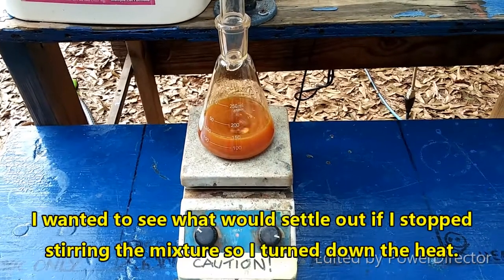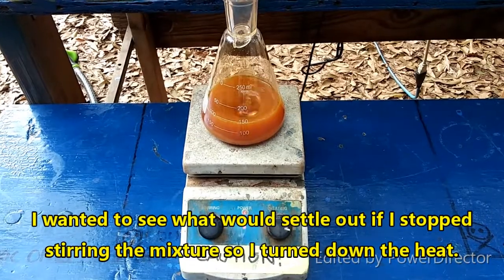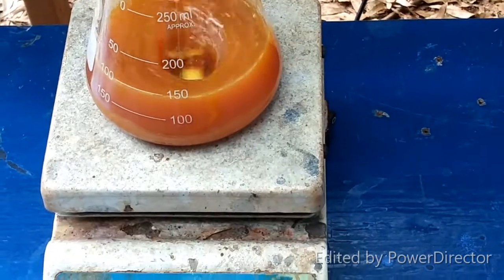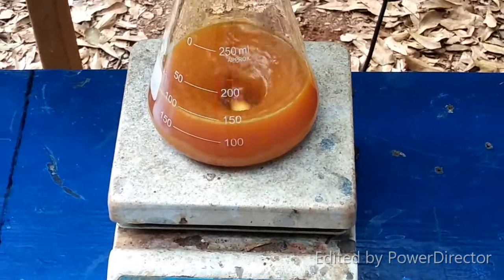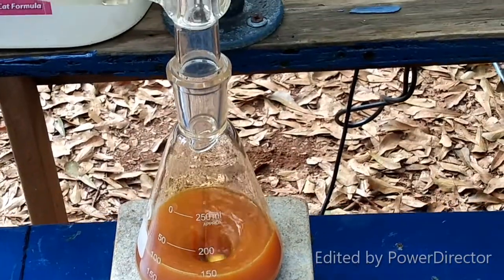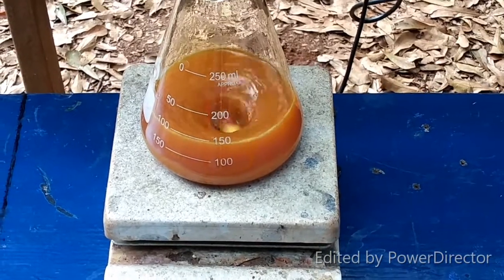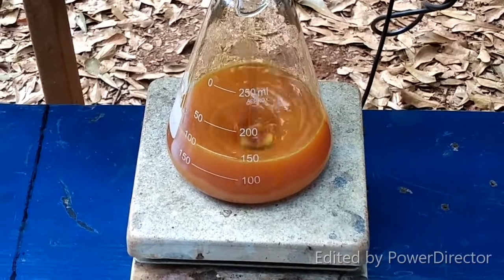All right, so I've learned one thing about this reaction, and that is do not prematurely turn down the heat, because if you do, the antimony triiodide will start crystallizing out on everything, like the stir bar there. I've turned the heat back up, and I'm trying to get it back to where it's refluxing again. It's getting there. But I didn't turn it down for very long, and I could already see it precipitating out. So when it turns this color, with that orangey-yellow color we had, it's done.